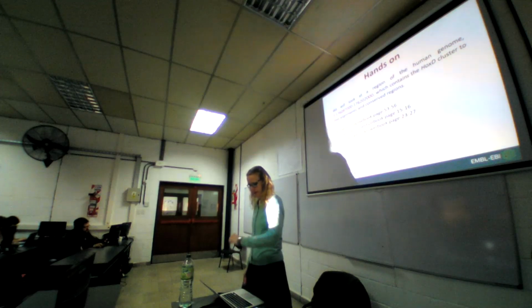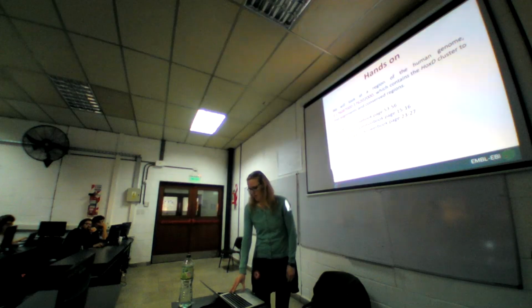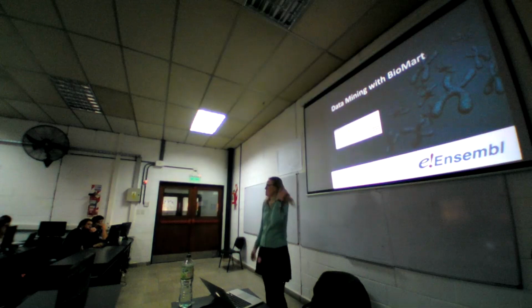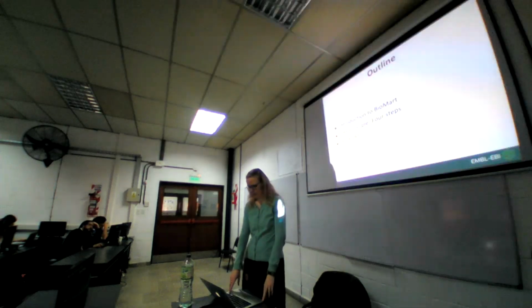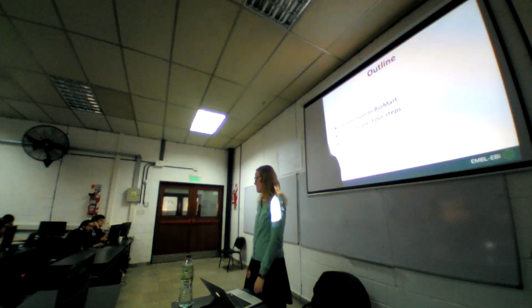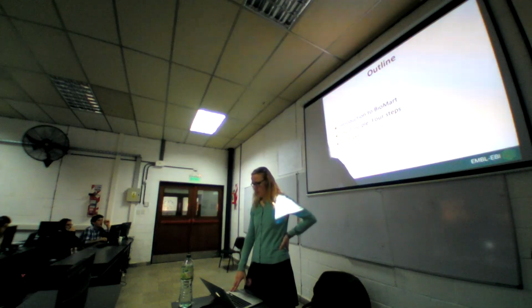Okay. So now we're going to spend the last part, before the summary section, having a short look at how you can export data from Ensembl in larger sets. This is done with a tool which is called Biomart. I will talk you through it and the 4 steps that you need to use for this tool, and then also mention the R package that is available for it.